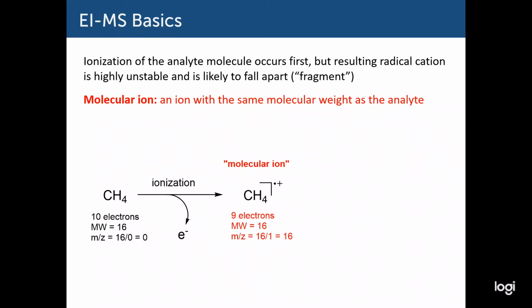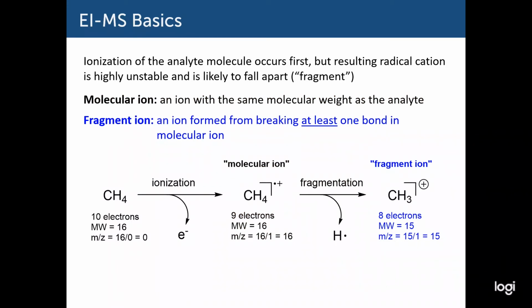One of the issues that we also encounter, especially in EI, is that these molecular ions tend not to be very stable. And so they start to what's called fragment, or shed atoms or whole groups of atoms as they travel down the detector. You can imagine this a little bit like having your molecular ion traveling down that tube sock, but before it gets to the bend, it falls apart into different kinds of species. And then each of those independent ions goes through the bend and lands in a different place on the detector.